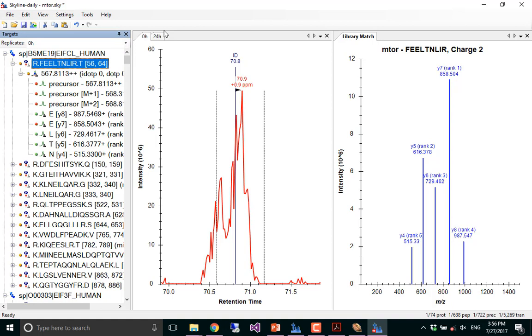It's two runs, right? One for each MZ amount. Oh, yes. These are 24 MZ wide windows, and there's 24 MZ wide windows, there's 25 MZ. Okay. So it's a lot of windows.